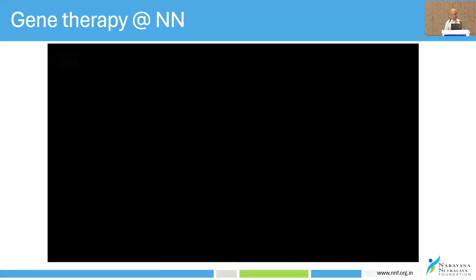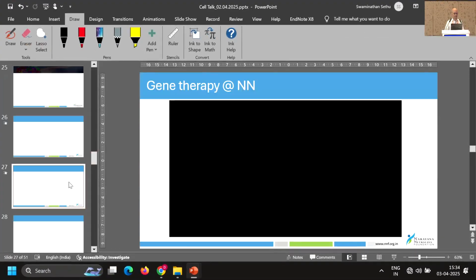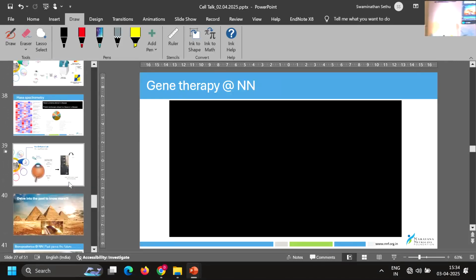Can you also ask somebody to talk about storing samples? A lot of people ask me about the biorepository, that how do we store samples? What is the whole protocol of storing a sample? Because that is what helped us to reach here.